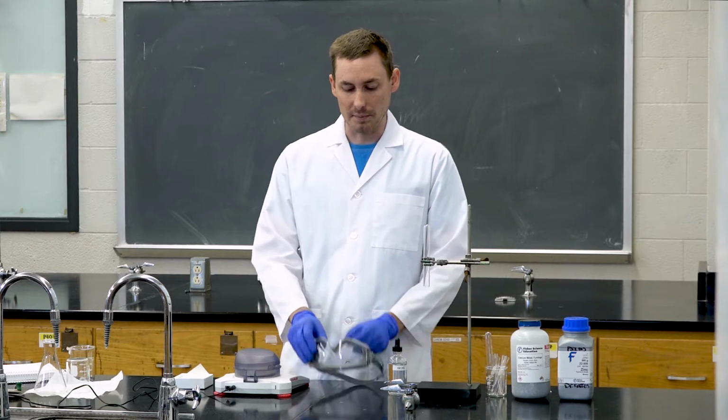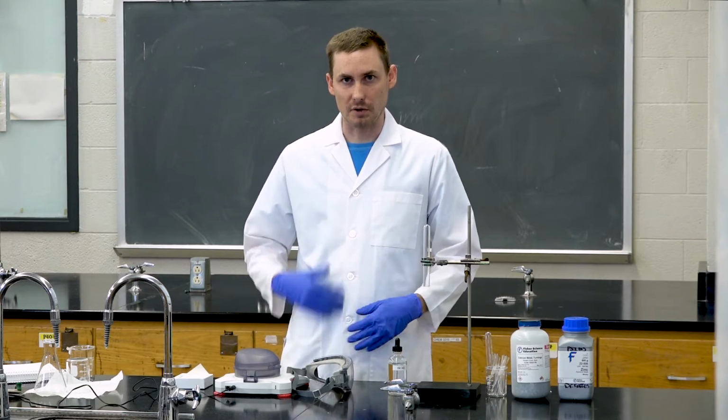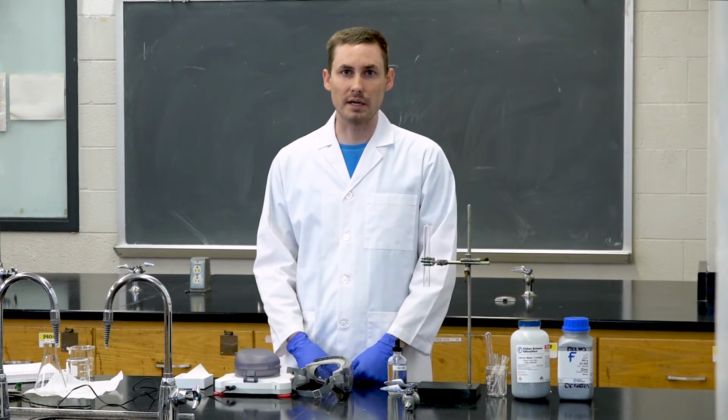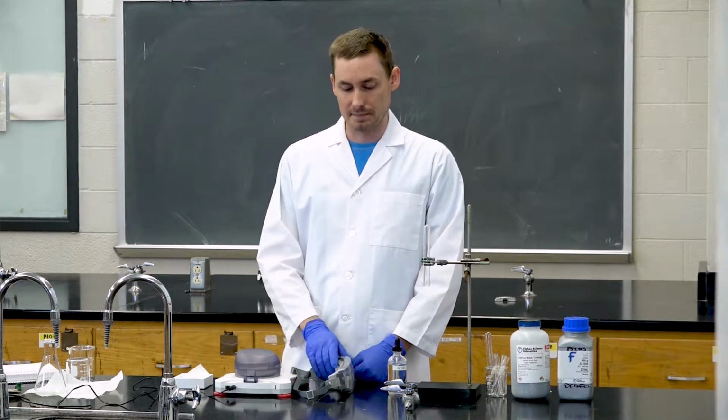Before we do so, we need to make sure we observe proper lab etiquette and protocol for our safety. That means wearing safety goggles, gloves, a lab coat buttoned all the way up with no skin showing below the waist. That includes wearing long pants and closed-toed shoes. And any loose hair needs to be tied back as well to stay out of the way of the experiments. Make sure that you do not eat or drink in the lab and do not smell or taste any of the chemicals that we'll be using in this lab.